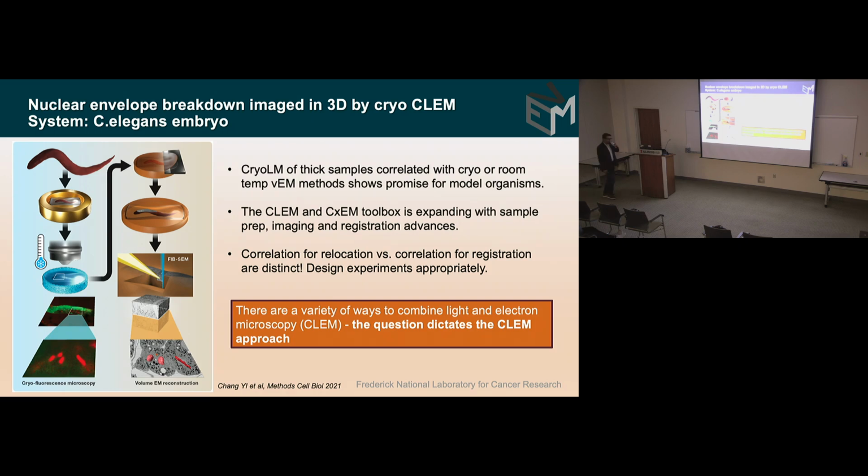When you think about the workflow for volumetric 3D imaging, how much of that workflow also includes CLEM? In other words, if you were to say CLEM starts doing this on a regular basis, how many times do you think he's going to try to do correlative CLEM or would be requested to do correlative CLEM versus just, I got these? You get my question? Okay, how much? Or what's the ratio?